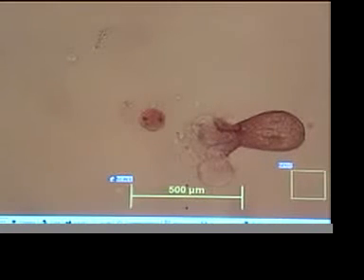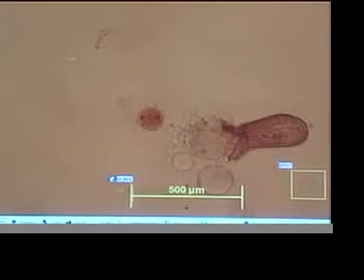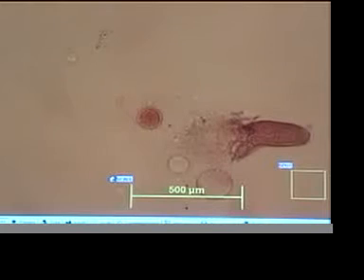We are getting an excellent devitalization of this organism. You're seeing the typical formations of spheroids. And this is fascinating. It's a sort of slow motion disintegration, emptying its contents out onto the slide, and now it becomes a little more dramatic there.